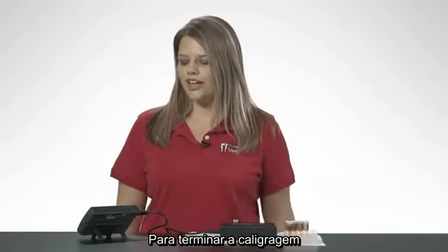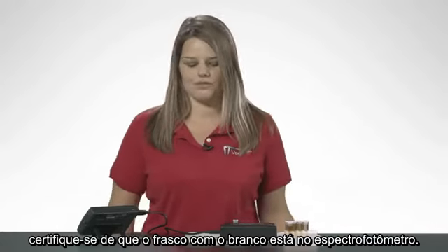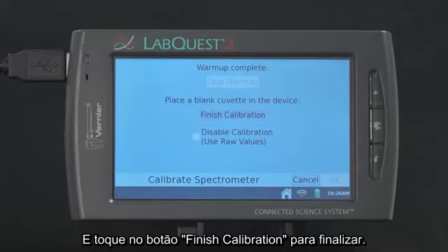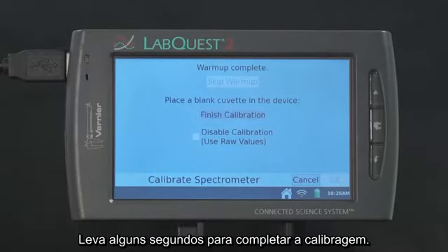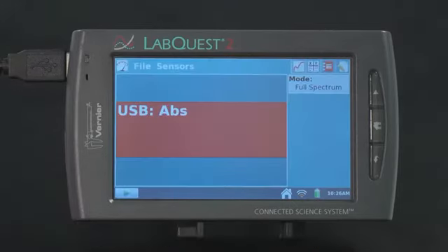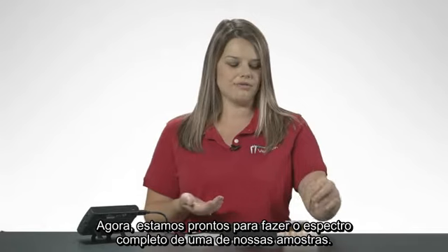Then to finish the calibration, make sure that you have your blank cuvette in the spectrophotometer and tap on the Finish Calibration button. It will take a few seconds to complete calibrating, and when it's ready, you will be able to tap on the OK button. And now we're ready to take a full spectrum of one of our samples.